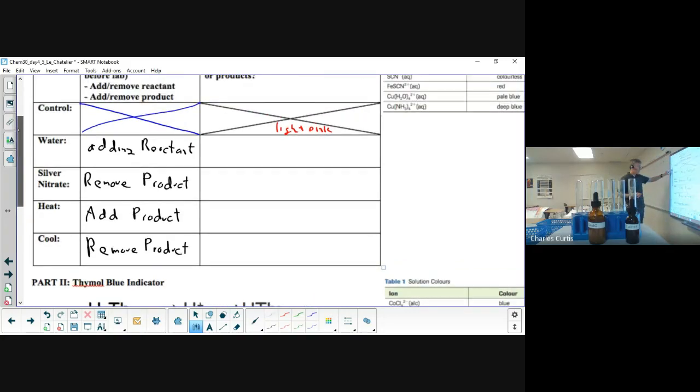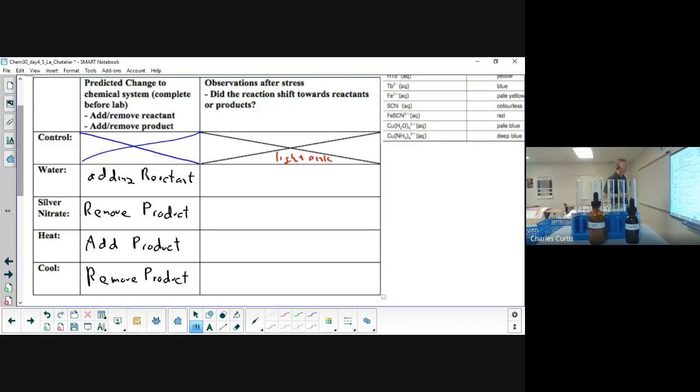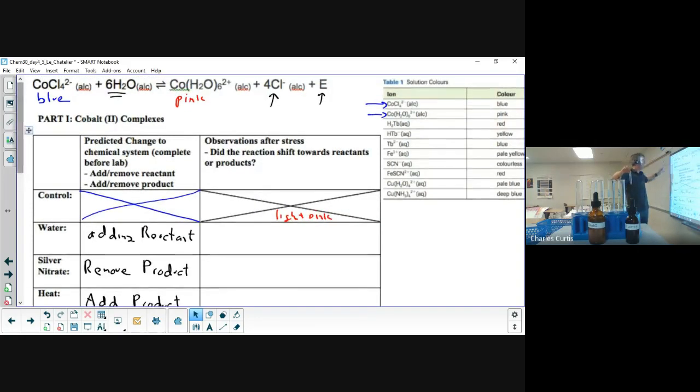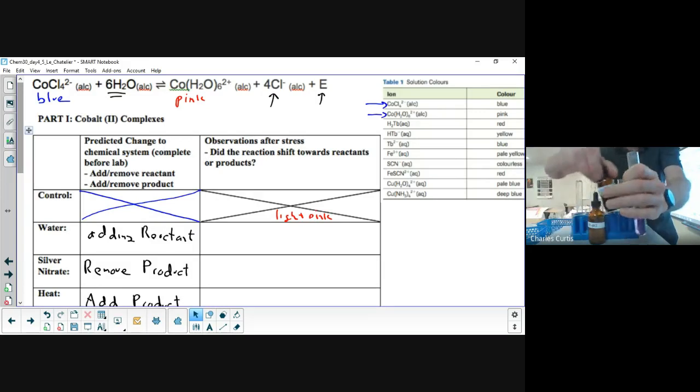So let's carry out this reaction, and we'll do both the observations and the analysis. Okay. So for the first one, let's add water. So here's our equilibrium mixture. Again, it's in the middle. Let's just recap the colors. If it shifts to reactants, blue. If it shifts to products, it will turn pink. Okay? So this system is at equilibrium. We're going to mess it up, and it's going to go to a new equilibrium.